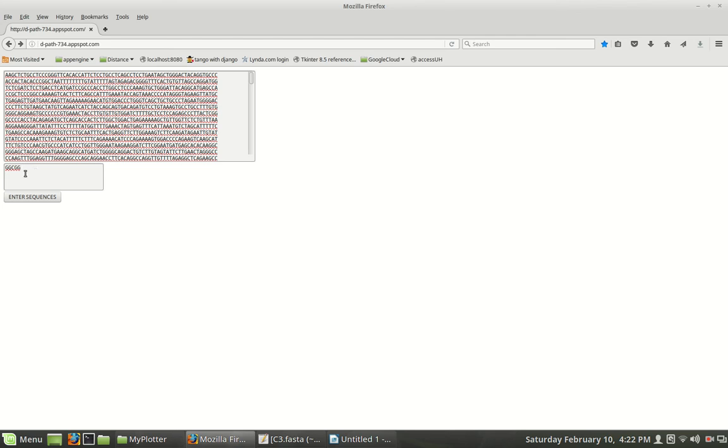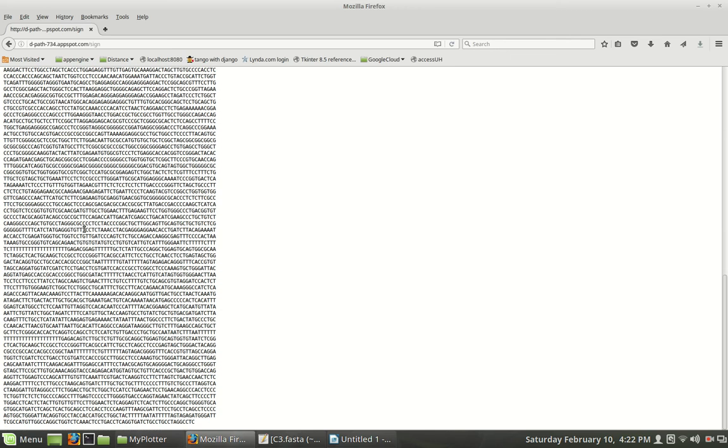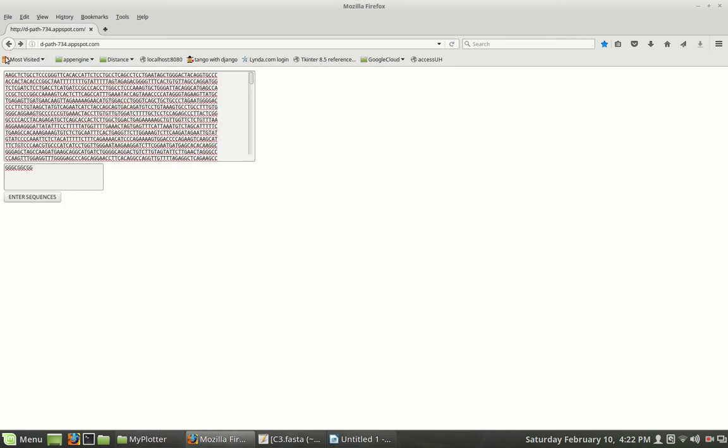Let's do something else. It's GGCGG, usually with another G over here. Let's see if one of these has another C here and a GG. I just know a little bit about this. Oops, that needs to be a G. Let's see if this occurs. No, this site didn't occur. Kind of a double one.